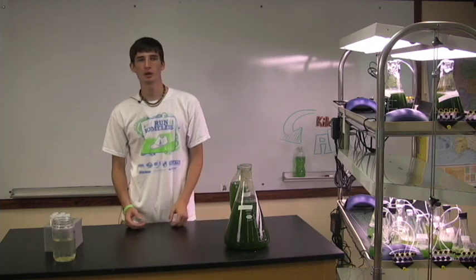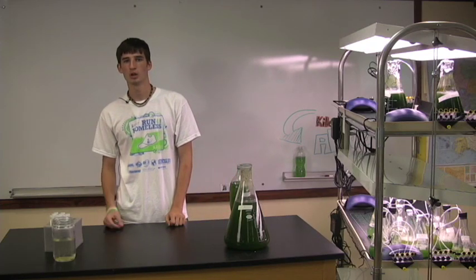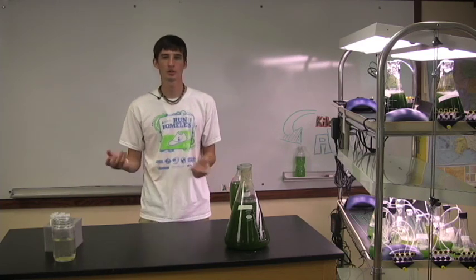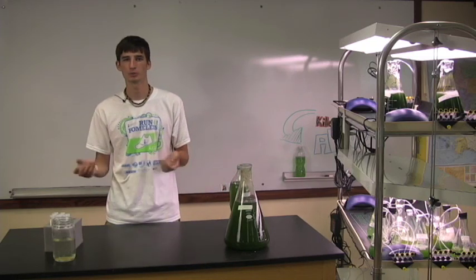The advantage of pond water is that samples are free and you can take as much as you want. For a classroom activity, you can have your students go out in groups and collect algae from different sections of a lake or stream, then set the algae up in the lab and compare the results, which should be different based on the different areas they collected from.